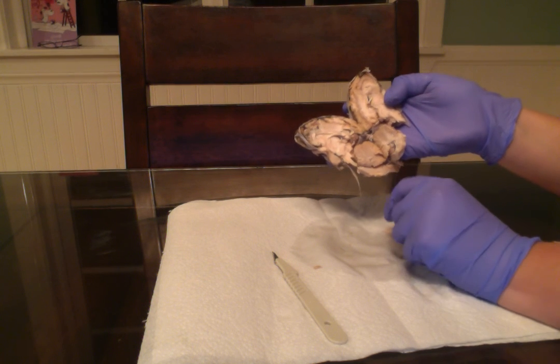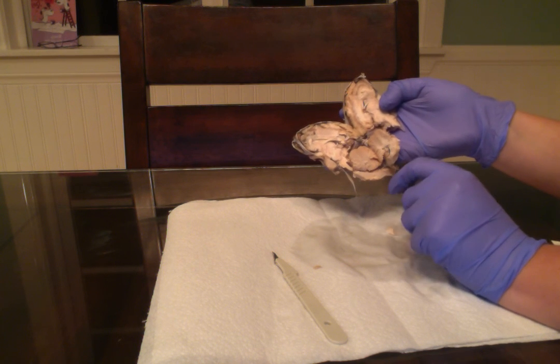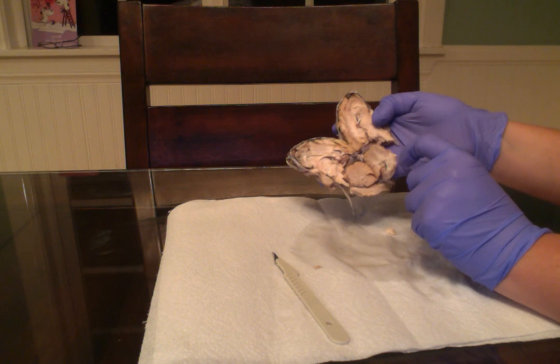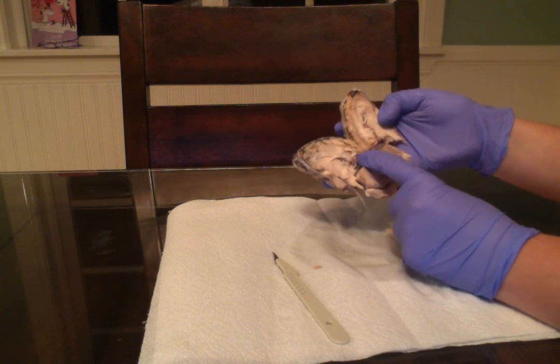And lastly, we're going to look at the pineal body, and the pineal body is right here. And that's all.